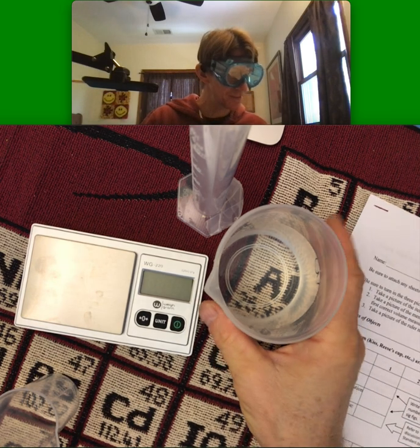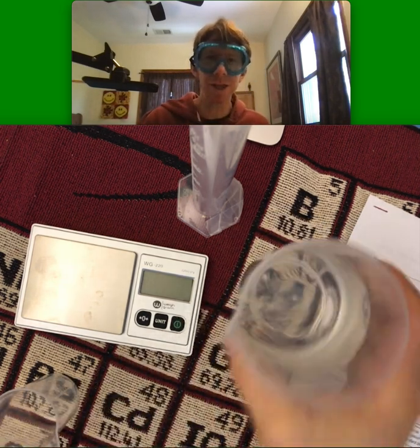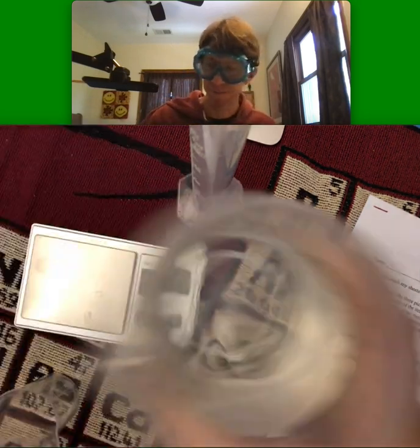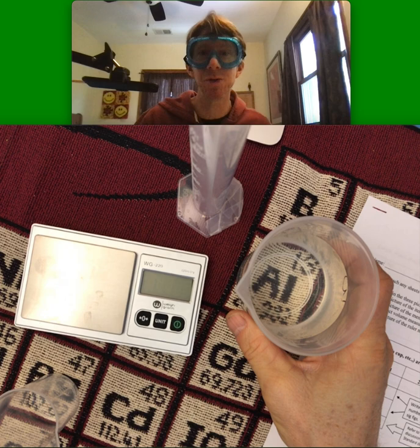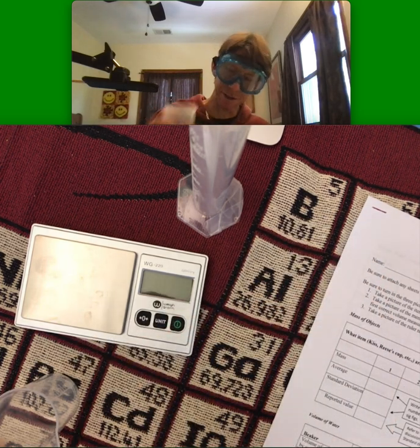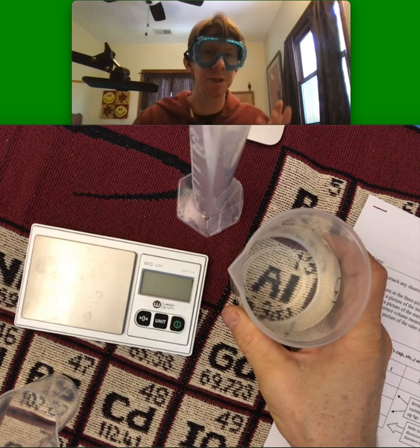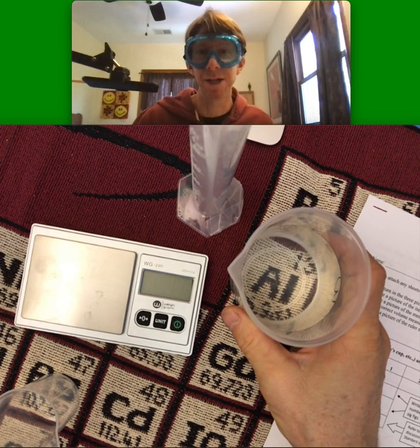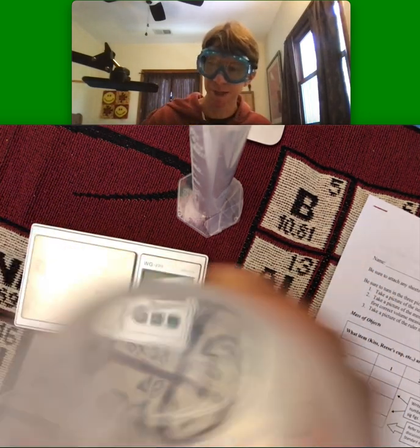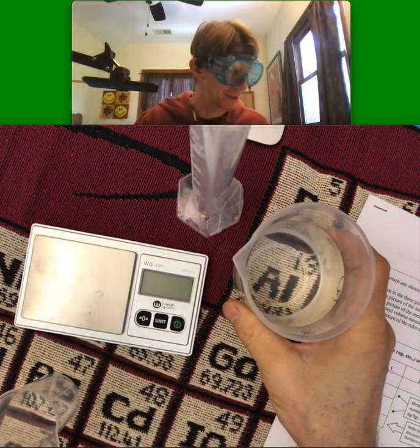Now, deionized water — that's what you'd use if we were in a chemistry lab. I have tap water here. You should get 200 milliliters in a 250 milliliter beaker. A little more or a little less than 200 is okay. We're just using this beaker to hold the water. We'll be doing measurements with it in something else.